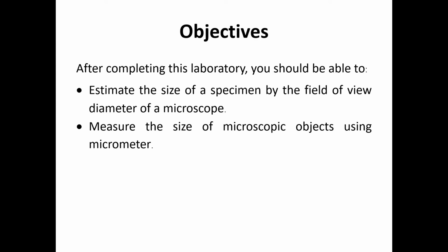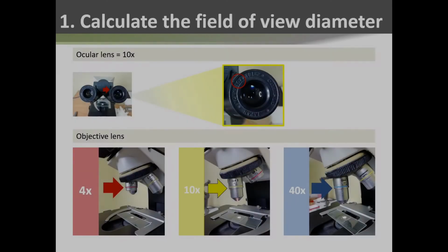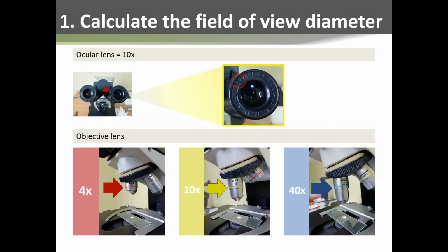After completing this lab, you should be able to estimate the size of specimens by the field of view diameter of a microscope, and measure the size of microscopic objects using micrometers. We recommend you follow this PowerPoint presentation and fill in all the answers in your lab report while watching.